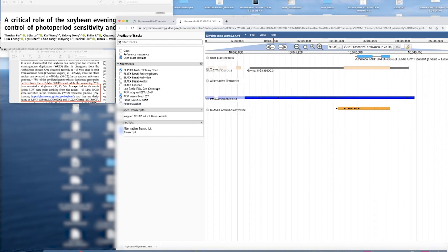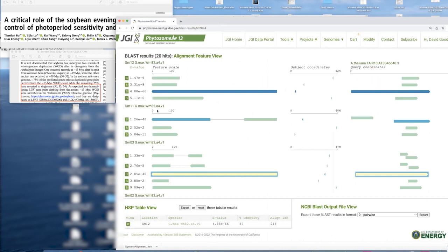So no particular surprises. There's a spurious splice introduced in the hit here, but that's BLAST for you. It's not a splice-aware aligner. So certainly what we're seeing in BLAST, both against the gene set and against the genome, is consistent with all the identifications we made before with synteny and orthology. So that's all good.